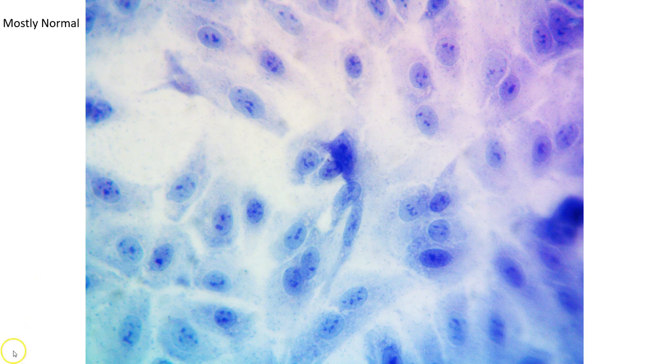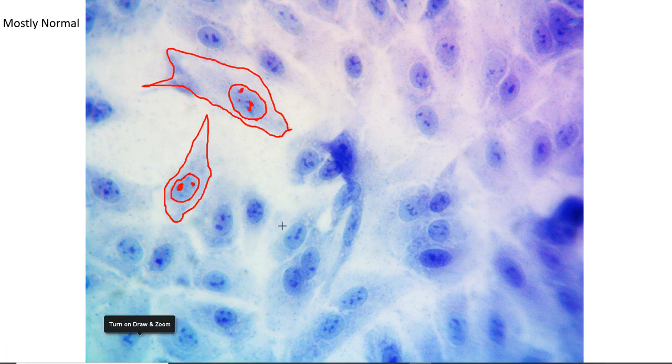Okay, so in this first picture, this particular image is from a HepaRG cell line. These are transformed cells, but they are normal untreated culture. So in this case, you see the cells are completely normal, typical looking. They have lots of cytoplasmic space. They have nice clean nuclei inside. You will see multiple nucleoli sometimes inside the nucleus because they are transformed. However, these are typical, untreated cells, so they are behaving the way they normally should. They are going through cell division just like they would in any other case, and they are dividing as usual.